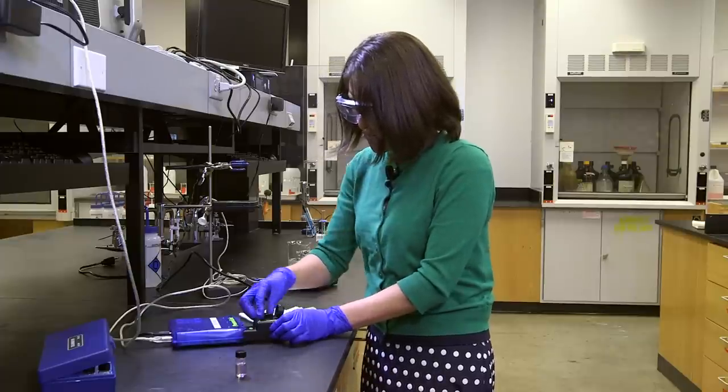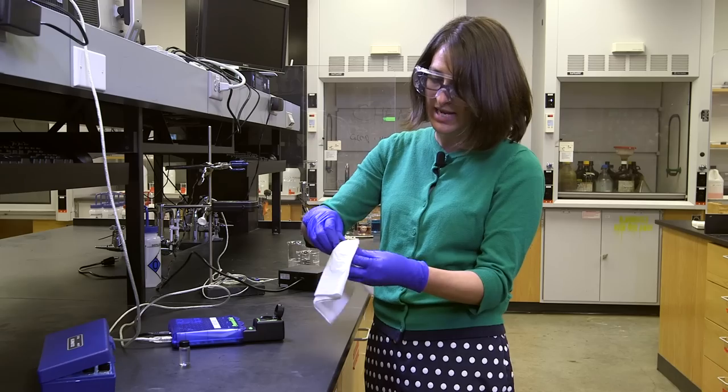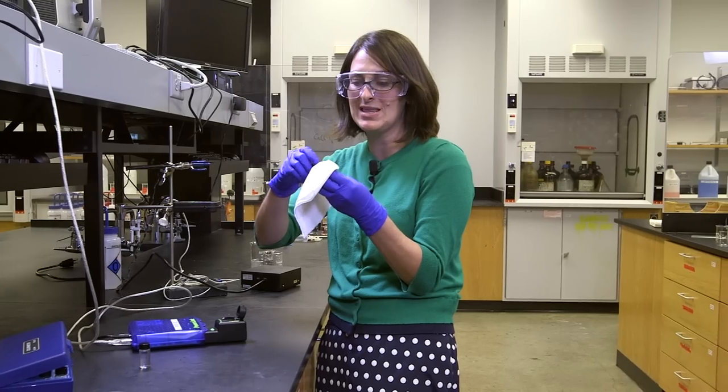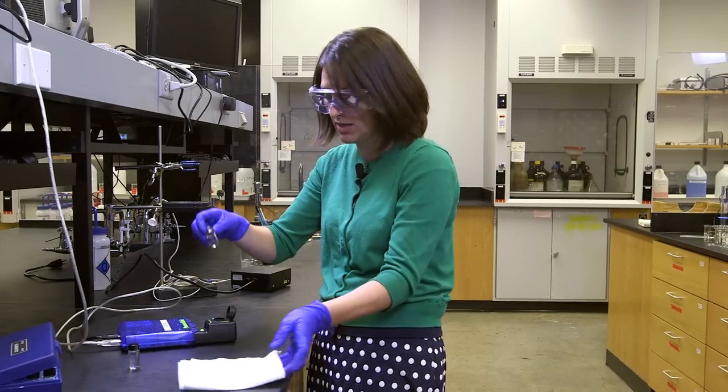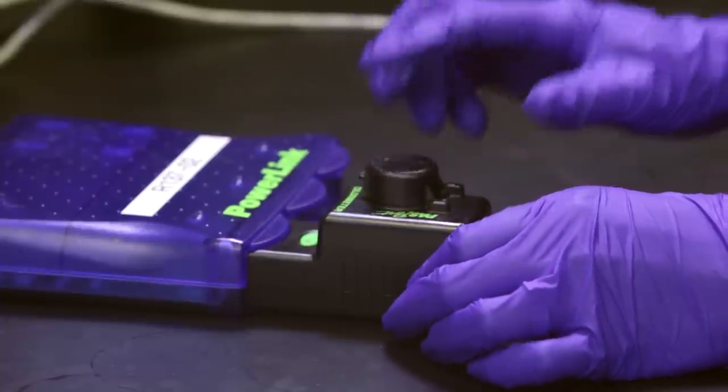Remove your cuvette, and then take your sample that you want to do your reading. I always wipe these off because you don't want anything blocking or interfering with the light that's passing through your sample. Again, close the lid.